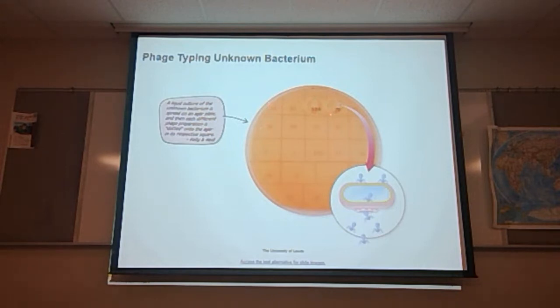And you'll notice the only two that are showing any reaction to this particular microbe are phage 52A and phage 79. And then there is a little artist rendering of the phage types going in and destroying the cells. You have even bacterial growth all over here, but you have this uneven no growth pattern here because of the phage typing.